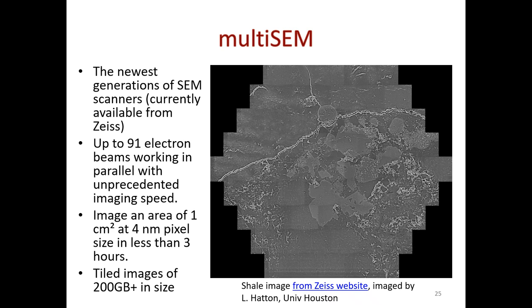The second problem is unifying. So, okay, somebody can stitch those together. Let's say that they have done a good job. This is called image registration, right? These beams will produce an image, but then you have to match it across those. So let's say that was done. You can see a little bit of shade difference because there are 91 electron beams. They're all coming from the same power supply. Not all of them will get precisely the same share of energy, and different energy levels will cause slight differences in shading.